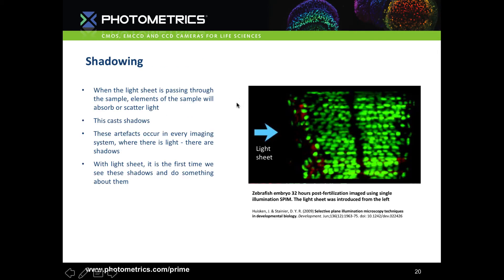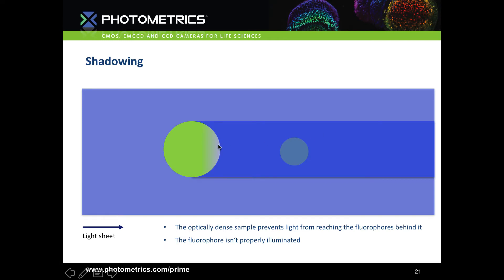Another notable issue is shadowing. Because where there is light, there are shadows. In this image of a zebrafish embryo, the lightsheet coming from the left creates shadows stretching across the image where it hits more optically dense structures, meaning parts of the sample within the shadow aren't properly illuminated. The lightsheet hits an optically dense part of the sample casting a shadow behind it, and the fluorophore hidden there gets less illumination.